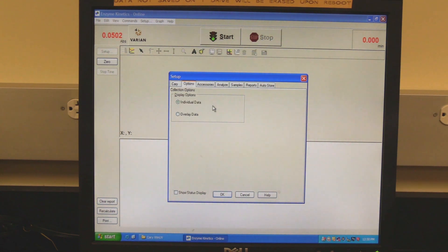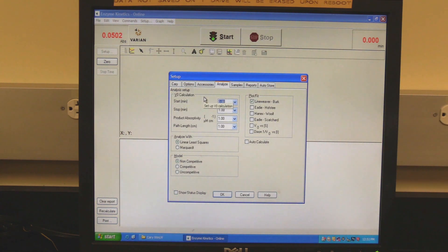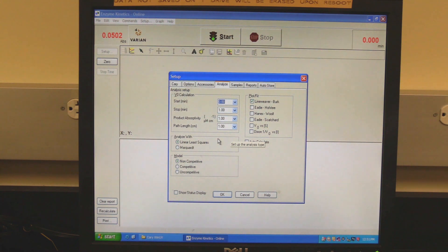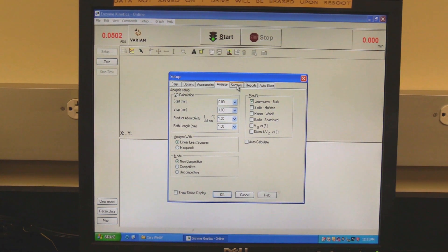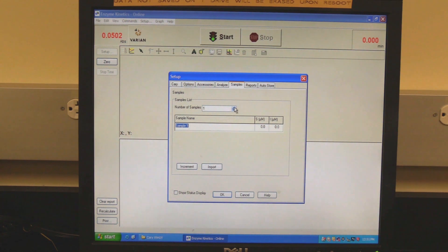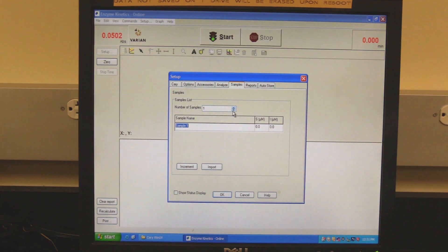Click on the Options tab and set whether to display data individually or overlay. Click on the Accessories tab. To use the cell changer, check the Use Cell Changer box and check the boxes for the desired cells. Click on the Analyze tab. In the V0 calculation, set the parameters used for the calculation. In Analyze With, set your analysis method. In Model, set the type of enzyme reaction. In Plot Fit, select the desired type of plot. Check the Auto Calculate box. Click on the Samples tab to set the desired number of samples using the up or down arrows, then input the component concentrations for each sample.